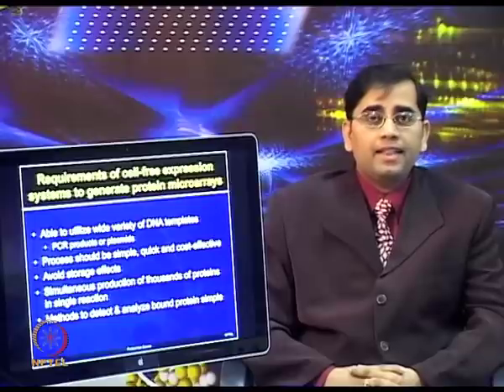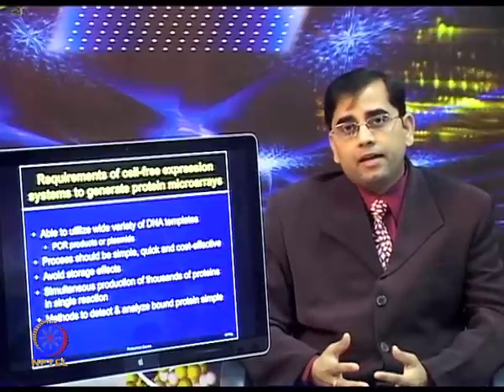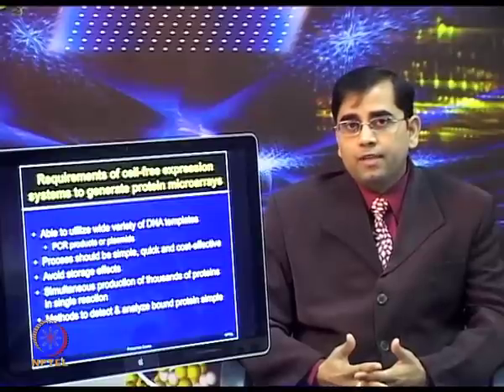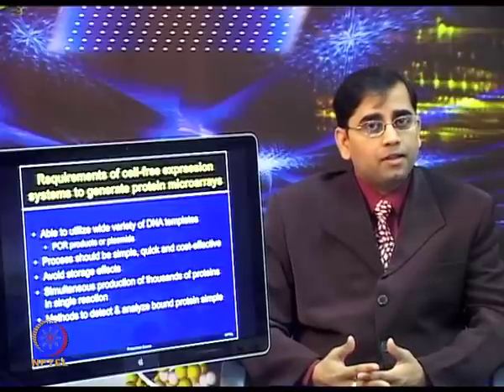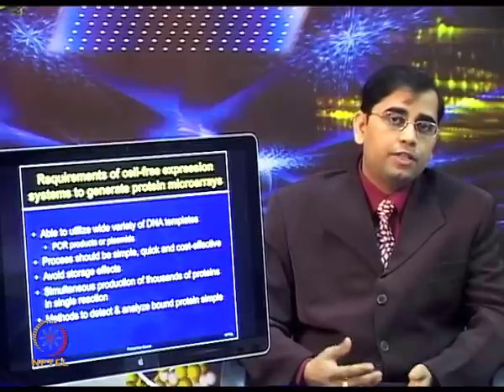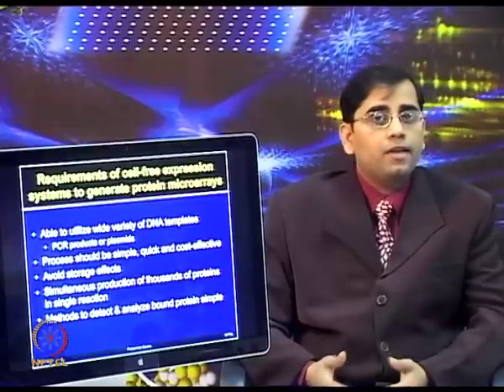The detection and analysis of bound protein should be simple. It means the assay method and the detection technology should be available, and it should be very simple. Most of these assays people develop are similar to what one does in classical biochemical labs to perform Western blots or ELISA assays. These assays are quite simple, and the detection system is simple, so that the readout can be used from common instrumentations. Let us first discuss protein in situ arrays or PISA.